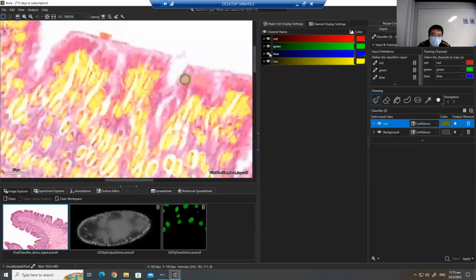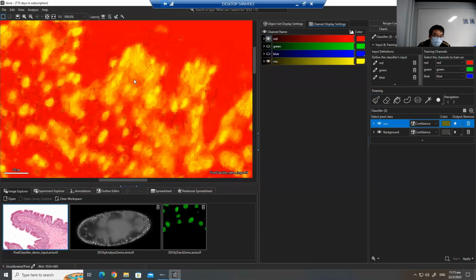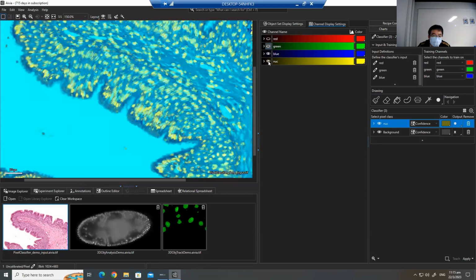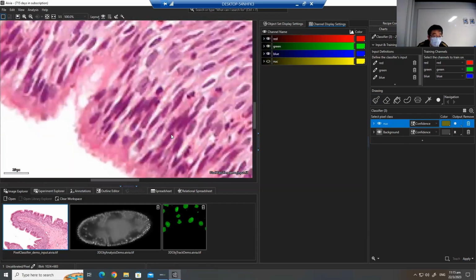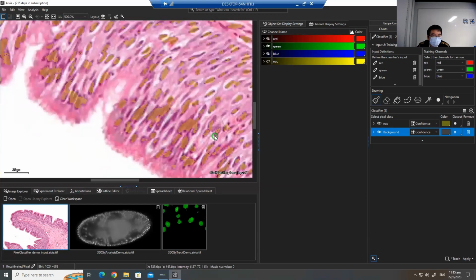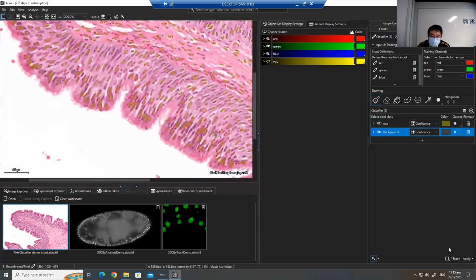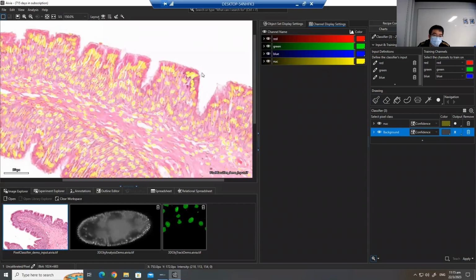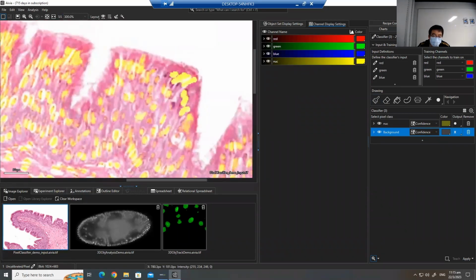Now it's better. Just everything is nucleus. That's how we run the pixel classification. No, we specify more background, more background, more background. Yeah. You see. And again. Now they are all nucleus. And you can run the 2D recipe with it.